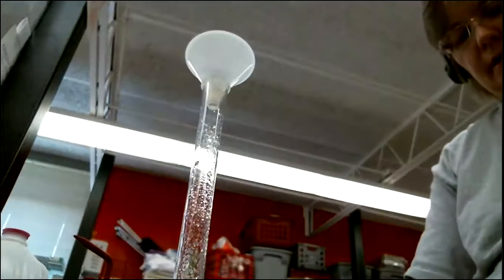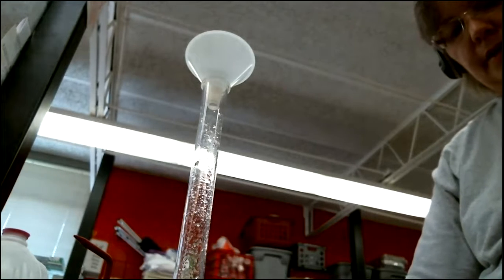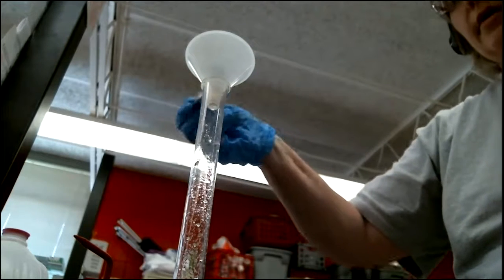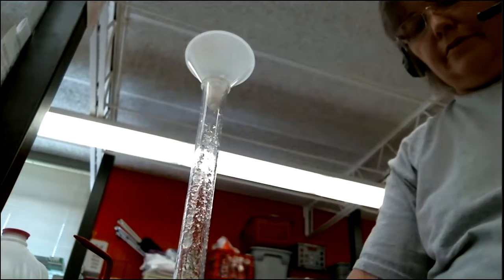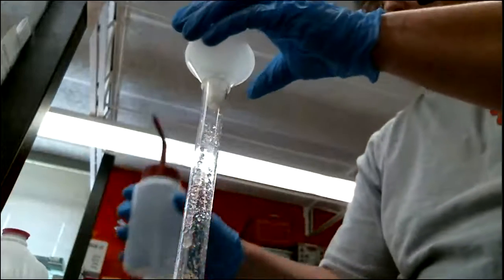All right, so we've got to get all this salt down in there and we'll have a 1 molar solution of magnesium sulfate. Now I can dissolve it out and fill it up to the mark, and that's what I'll do to make it an official solution. And that's what you would do, and you would fill it up.